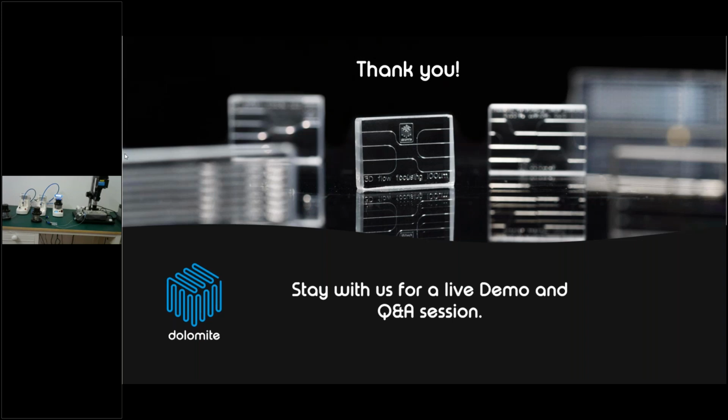So the second question: as for manual calculation of solvent flow rate, can we get a linear relation between the solvent flow rate and actual flow rate, or does it depend on the solvent used? You mean the solvent for the calibration step? Yes. Actually, it depends. I believe it depends on the solvent used. With different solvents, using the calibration step, you can get a linear relation between the solvent flow rate and actual flow rate.